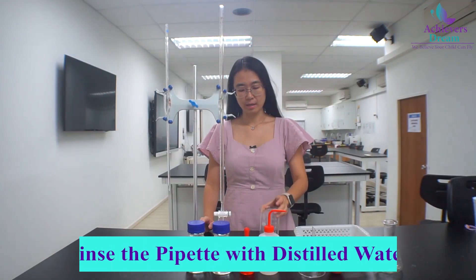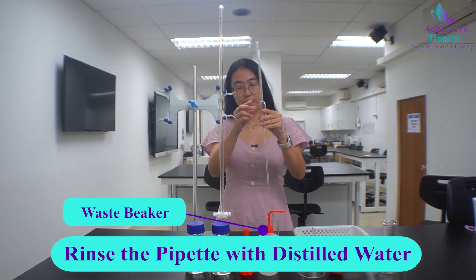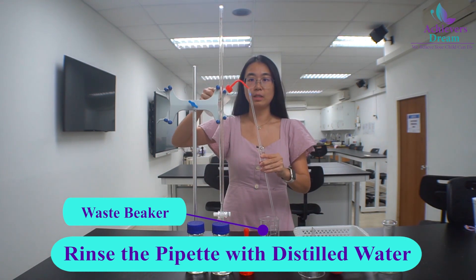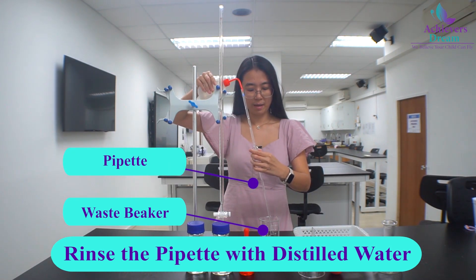Prepare a waste beaker. Point the tip of the pipette into the waste beaker and rinse with distilled water. As you rinse, remember to rotate the pipette.